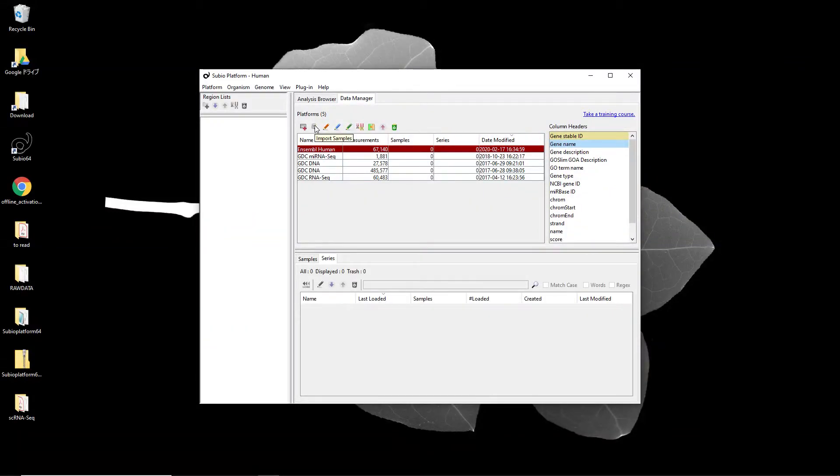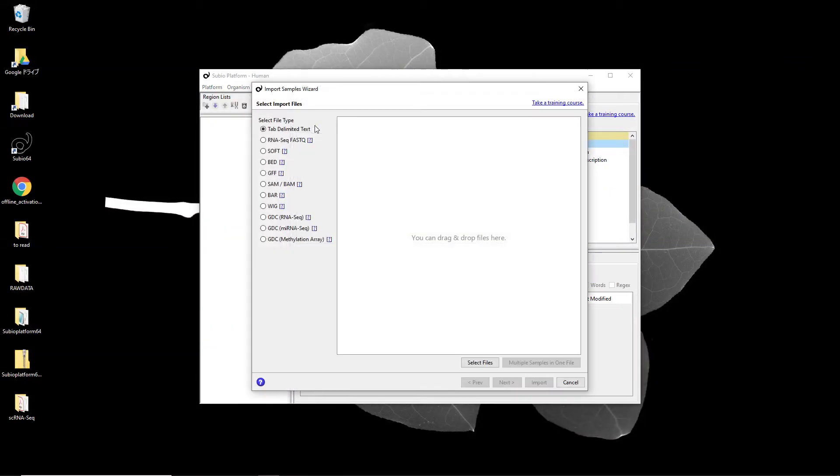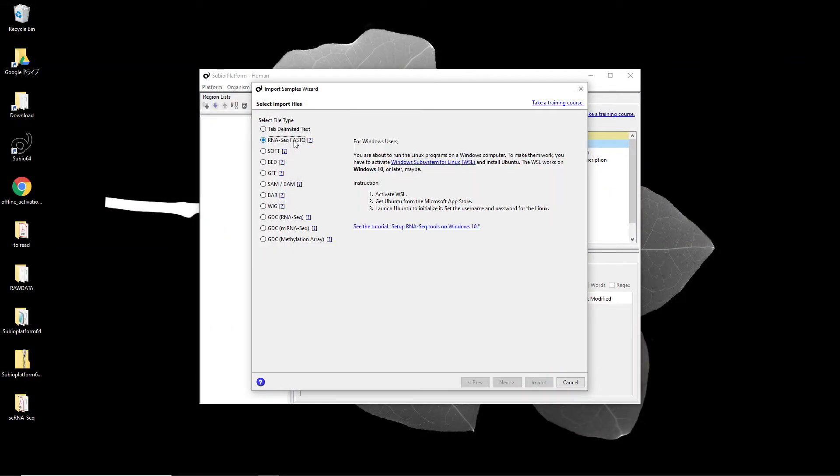RNA-Seq Fast-Q Processing on Windows 10 requires activating WSL and Ubuntu. Otherwise, you cannot go to the next step.